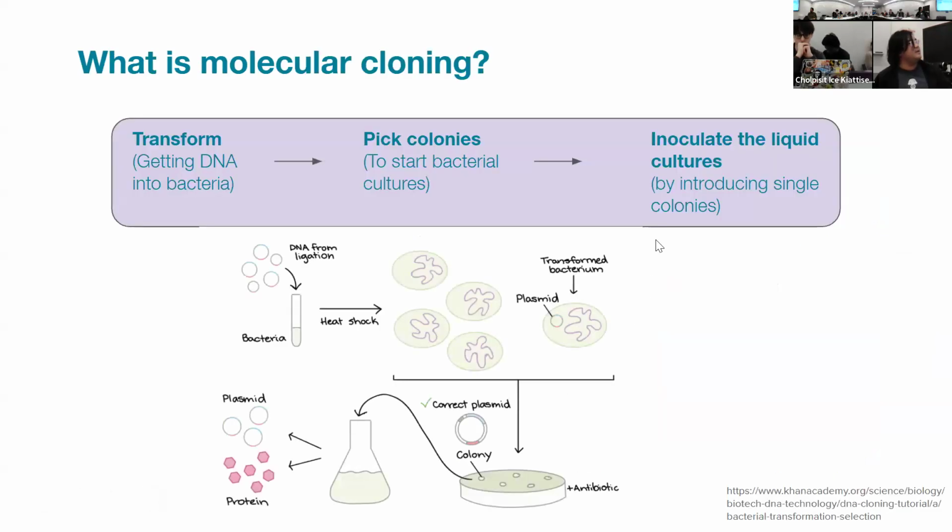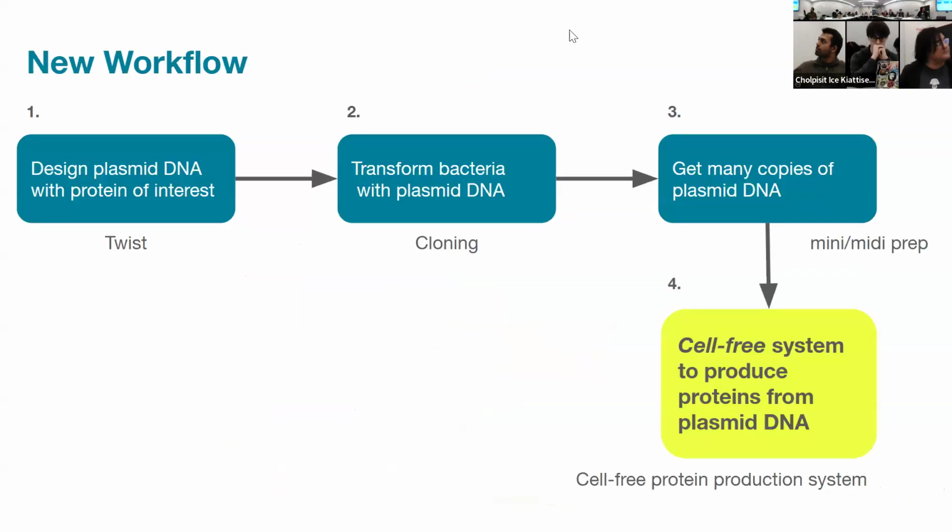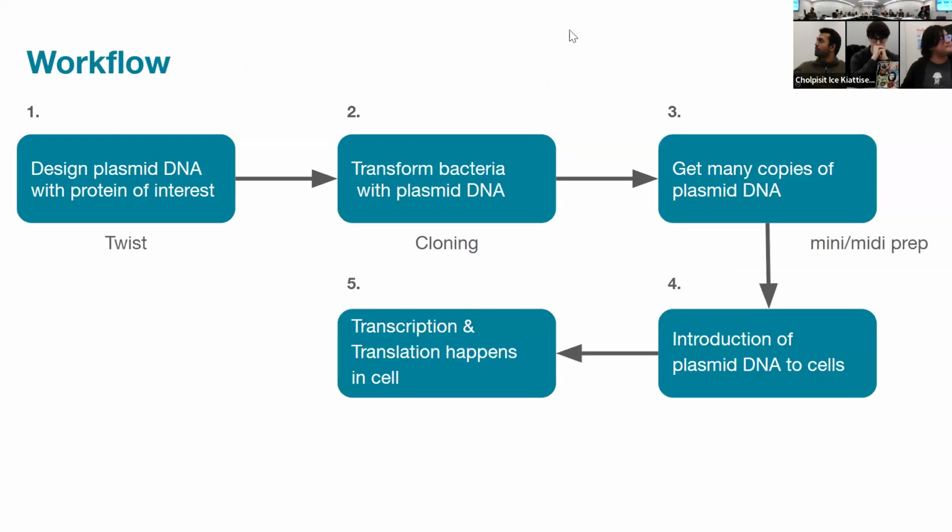So this is something you can look at. This is probably the last slide before we get into the technical part. Could we go back two slides? Yeah, one more slide. This workflow slide is a very critical slide for all of you. Understanding this workflow is essential for basically all of our labs, and this is exactly how we process, for example, the Gibson assembly lab. If there's anything you get out of this, it's this workflow that you want to know and use for the rest of the course, and even for your final project too. We work through a lot of similar techniques to get a gene of interest.